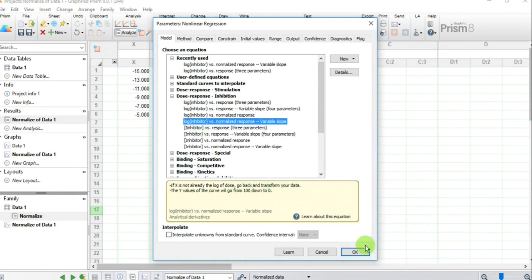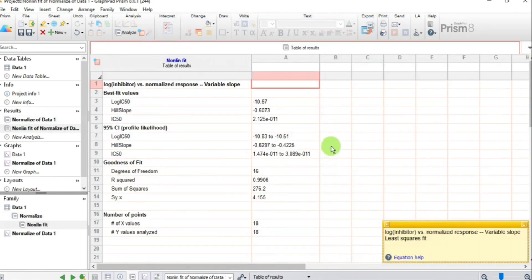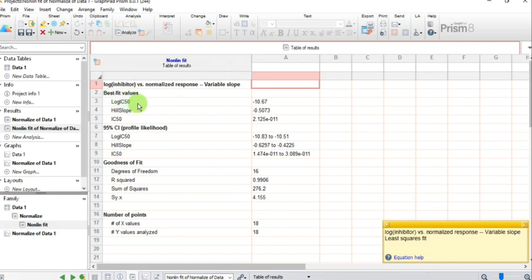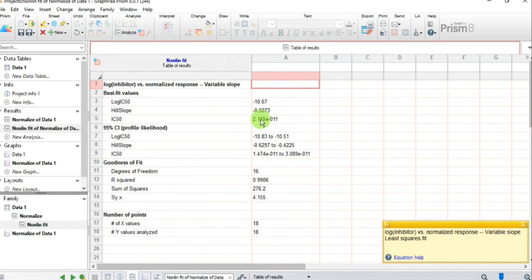Press OK and Prism gives you results straight away — very smart software. Under best fit values you can see the Log IC50 or Log EC50 value, which is minus 10.67. The IC50 value — which was our aim, also called the EC50 — is 2.12 × 10⁻¹¹. It looks a bit unusual but I'll explain it further.